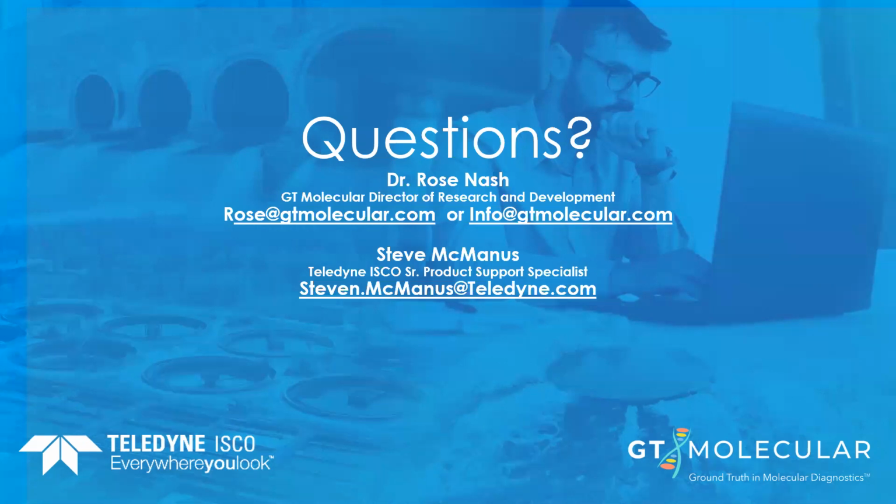But I do want to bring back one of the slides that Steve had in his presentation today, which was that Water Research Foundation guidance on sampling. This was a document that came out of a large group of experts in the field of wastewater and wastewater-based epidemiology. And they came together a couple months ago and made their expert recommendations on setting up a sampling plan and how to store samples. And their recommendation right now as well is to avoid freeze thaws and to store the sample at 4 degrees for less than 2 weeks. So that's a really nice resource that I recommend everyone takes a look at if they're considering bringing on a sampling plan.